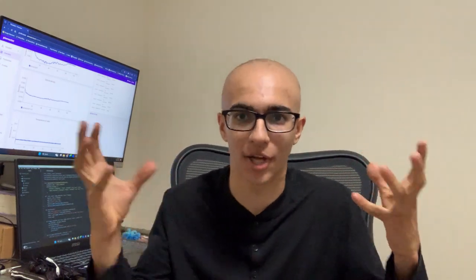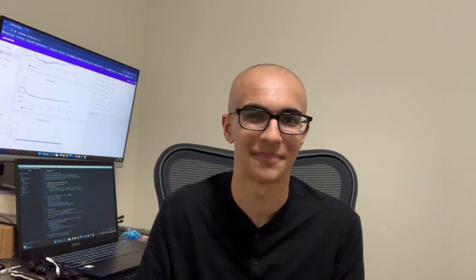Last week, I coded my miniature bioreactor for the first time, and it was awesome to start getting into the intersection of biology and coding. And this week, I've written up some more advanced programs to do some more advanced things with the Pioreactor, and I'm going to show you how they work right now. Hey, I'm Olian, and I'm once again experimenting with microalgae.